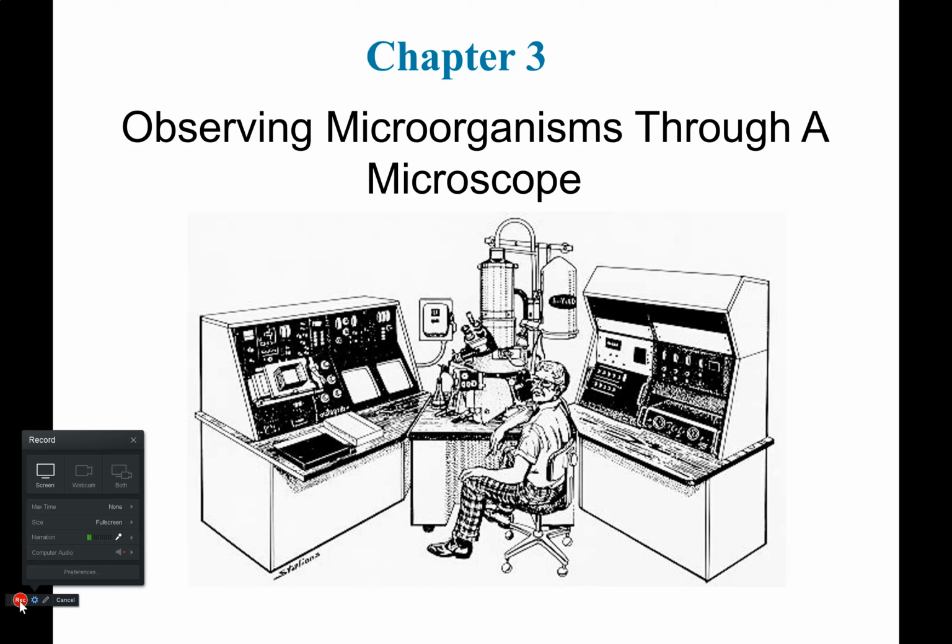I chose this picture because when I was going to UC Riverside for my PhD, I studied a virus, and I used electron microscopes to view my virus, and I utilized an electron microscope that looked pretty much just like this.